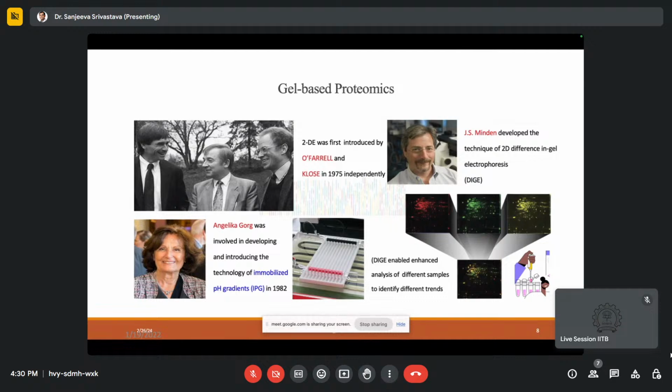But in this context, I have also been giving you the hint that even if you want to do mass spec directly, gels could be a good intermediary point for you to do multiple things. One, you can do qualitative analysis for your sample prep. Second, you can use them as a fractionation way, cutting down the bands and looking at the entire gel, to separate the complex proteome.